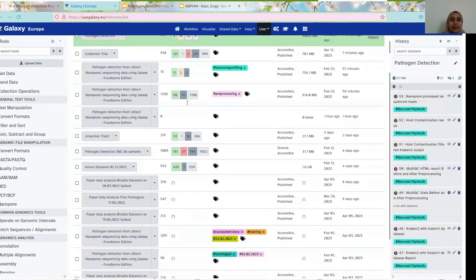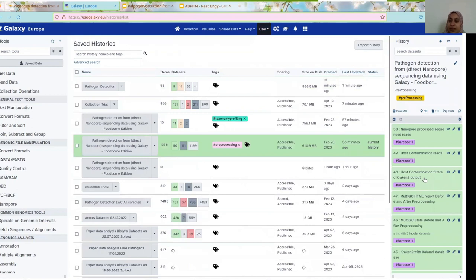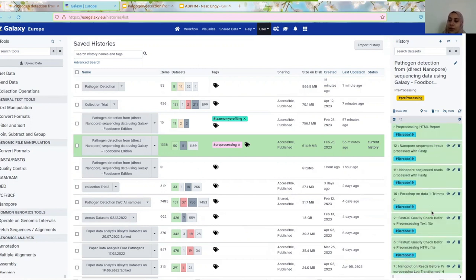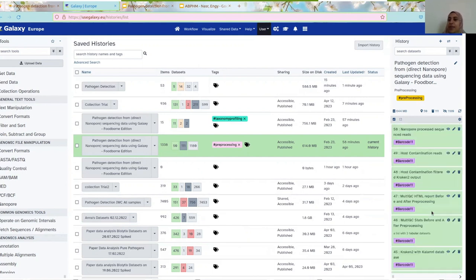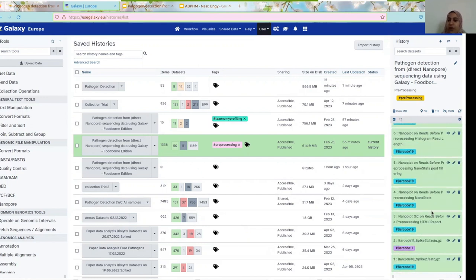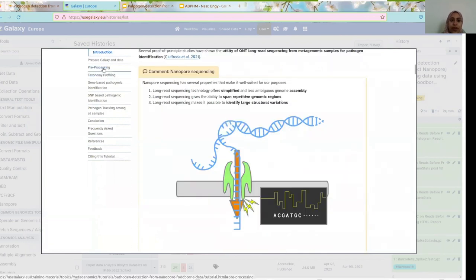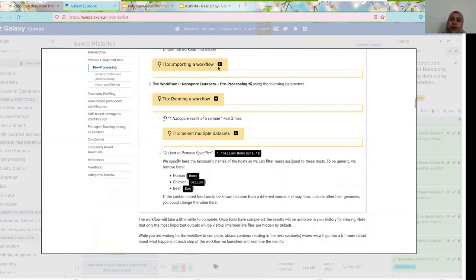I had here the same two datasets — barcode 10, spike 2, and barcode 11, spike 2B. As you can see, all the tools have finished running, so the color is now green. Going back to the training — now we are in the pre-processing. We have already run the workflow. We set the specifier to Gallus, Homo, and Bos. Since we know we are spiking chickens, all the host sequences we should find are chickens to be removed. After running this workflow, we should be left with all sequences that are not chicken.